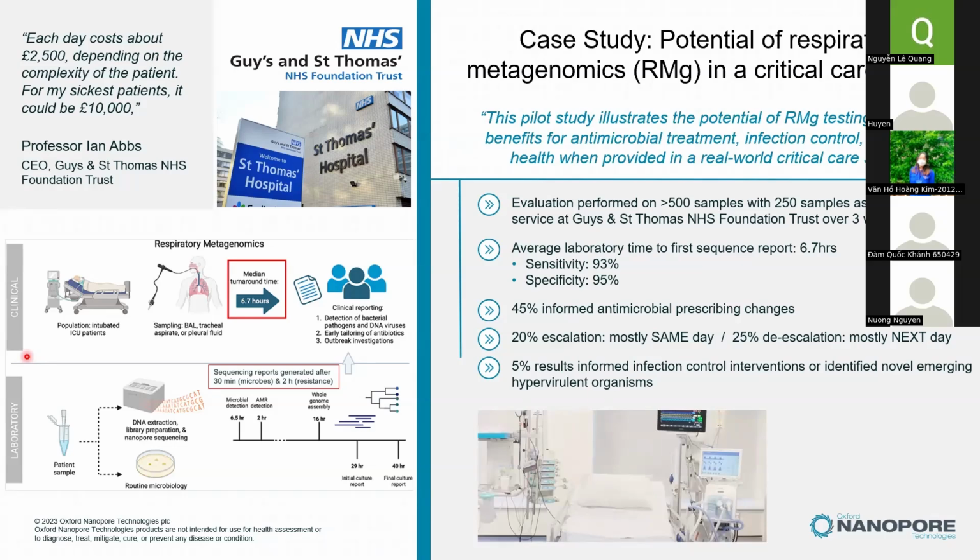If I understand you correctly, your question is whether to use Bioanalyzer or TapeStation for QC, right? Yes. Depending on your lab, whether you have a Bioanalyzer or a TapeStation, both are fine.